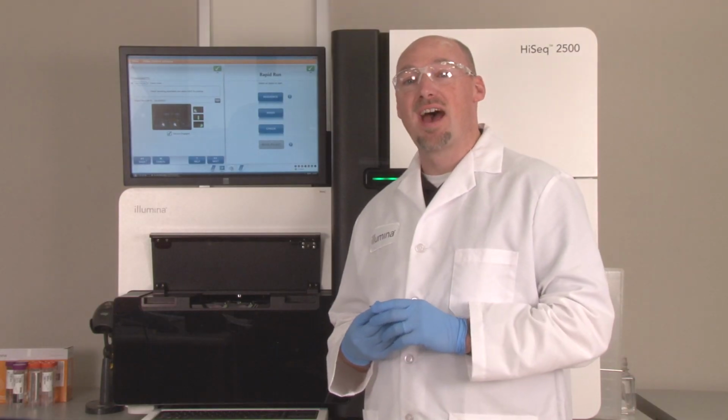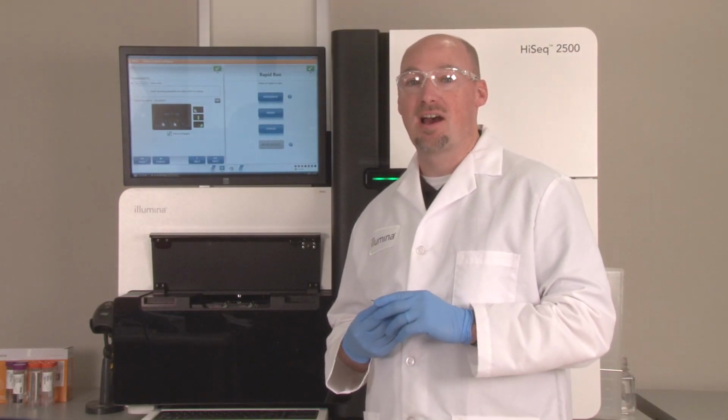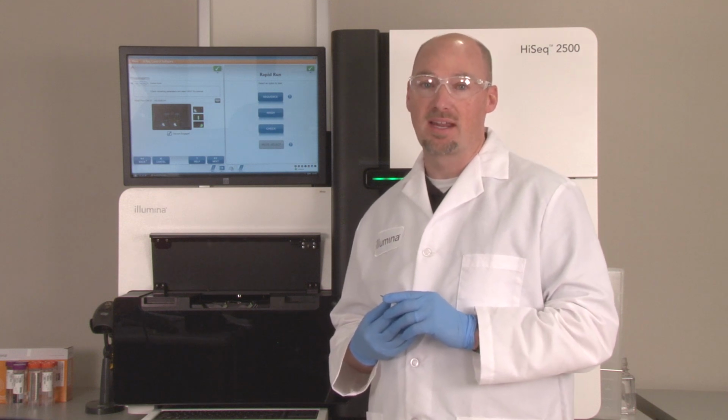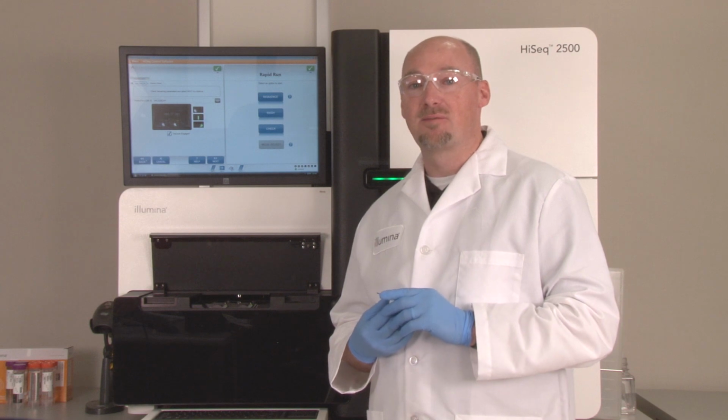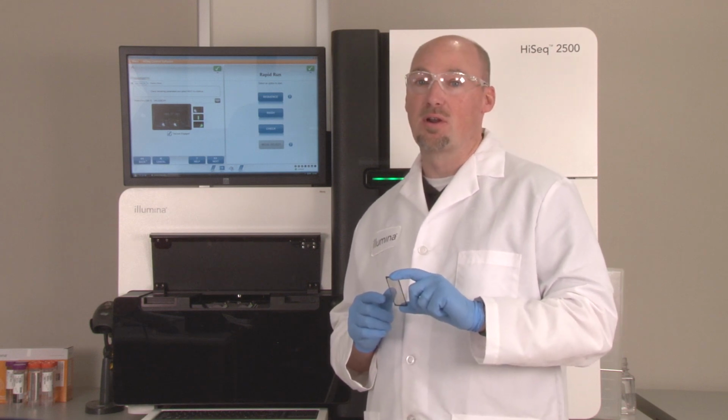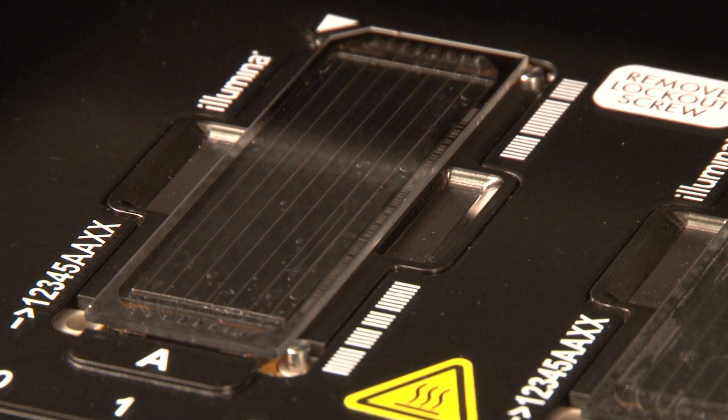A useful skill to have when operating a HiSeq is how to determine where a fluidic line clog or blockage is located. Clogs can be identified by two characteristics: slow flow or no flow at all through the flow cell lane, or backflow as seen here.